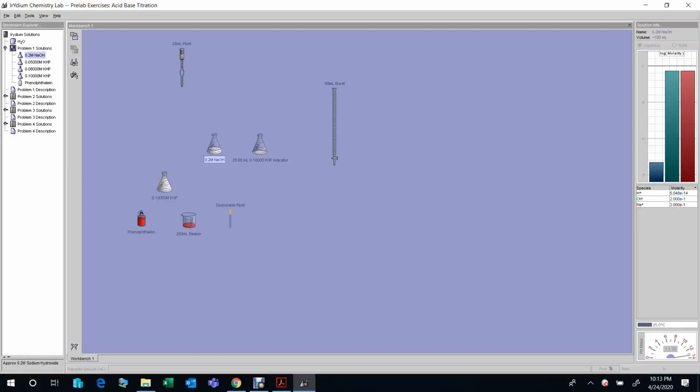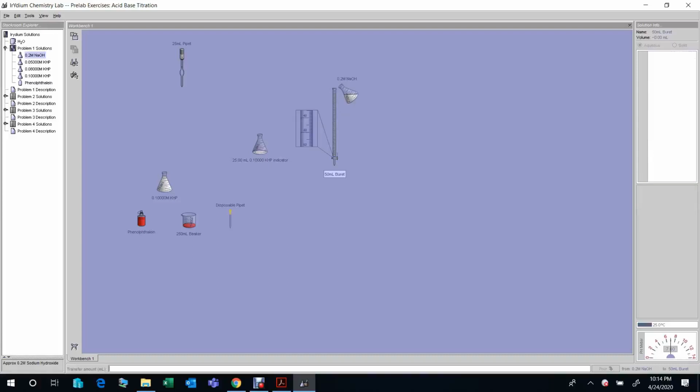And then you see here we can just add, for example, 40 milliliter solution. We can just add around 40, because if we add 50, it may overflow. If we add 40, it's very unlikely that we overflow the burette. So 40 is more than the 12.5 that is needed to complete the reaction, right?